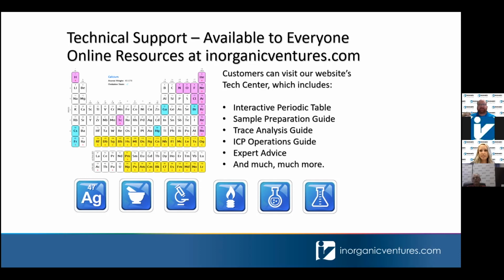We usually stabilize in just kind of our standard matrix, which is 10% hydrochloric acid. But depending on what your needs are, you can probably go lower than that. Any amount of hydrochloric acid is going to stabilize the mercury, as far as what we found for our standards. And then for nitric, we recommend 5 to 10% nitric for stabilization of that.